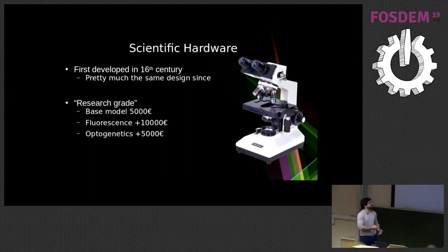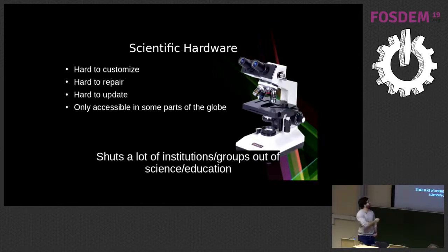And they're plugged to mains all the time, which means that for some parts of the world, combining all of these, it is really hard to get them, right? So they're hard to customize. If you have a 5,000 piece of equipment, you don't want any student in the lab opening it up and adding LEDs and changing things or anything like that. They're hard to repair because there is only one company that provides this one specific model, for instance.